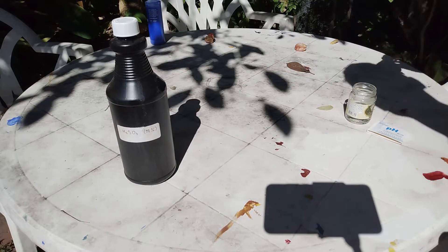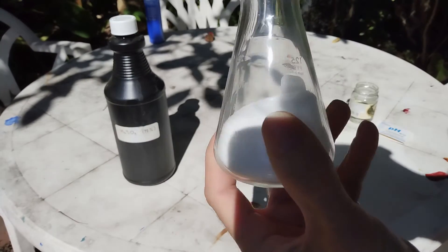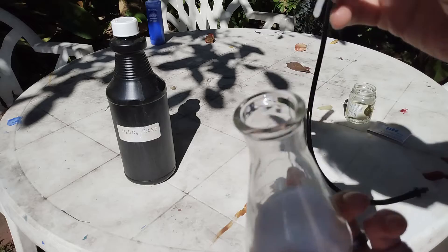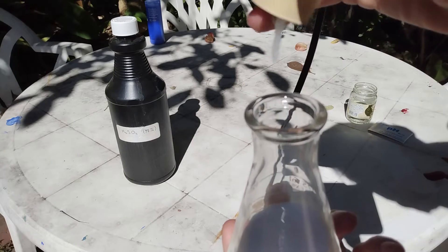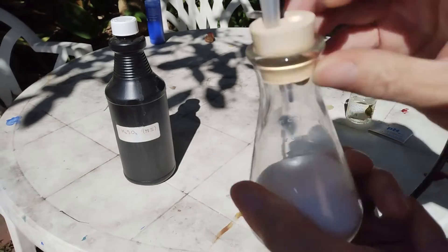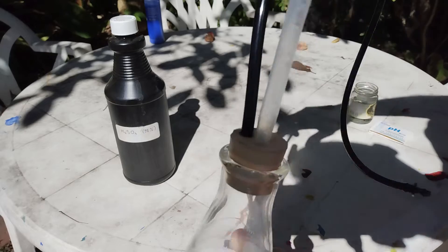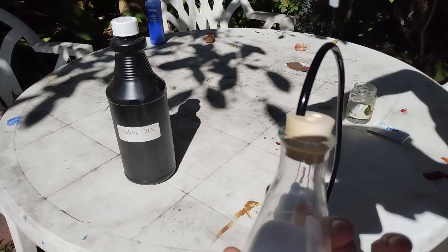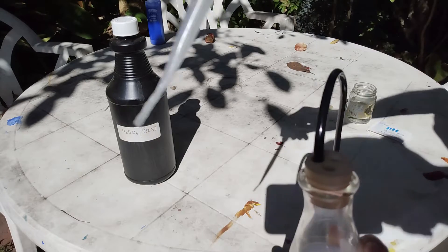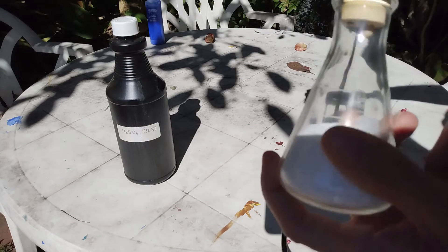You will also need some sea salt. And here I have a cap with two holes in it, with a hose and a pipette. I'm going to use this pipette in order to pour some sulfuric acid into the flask.